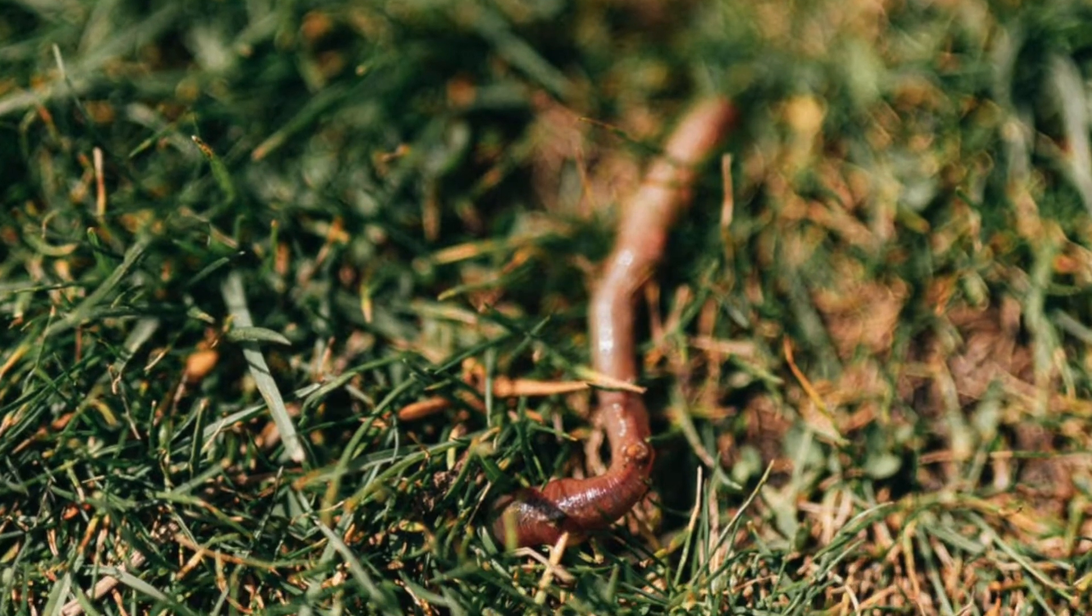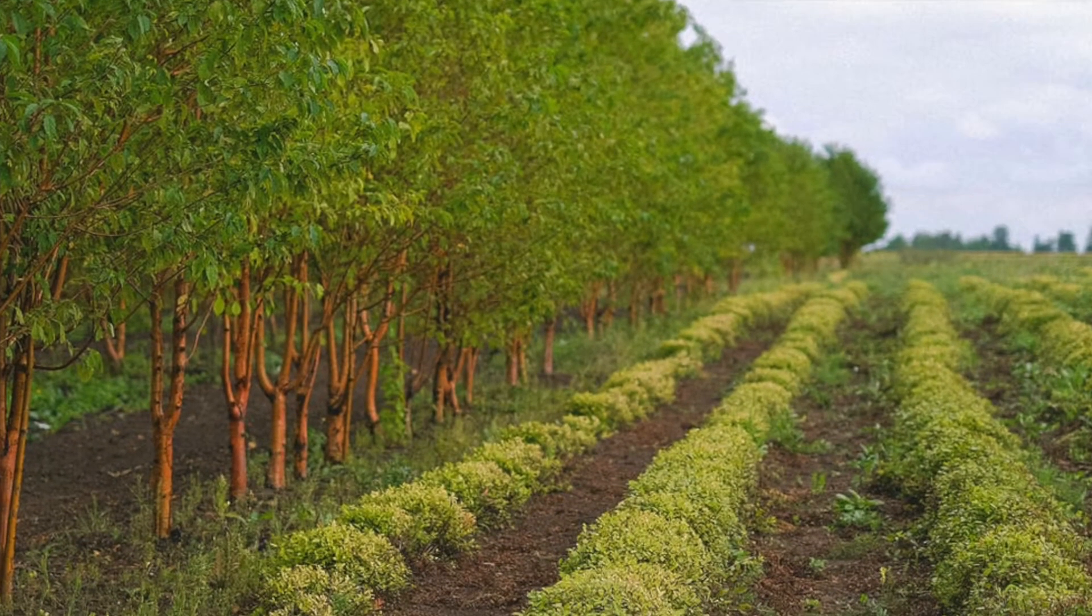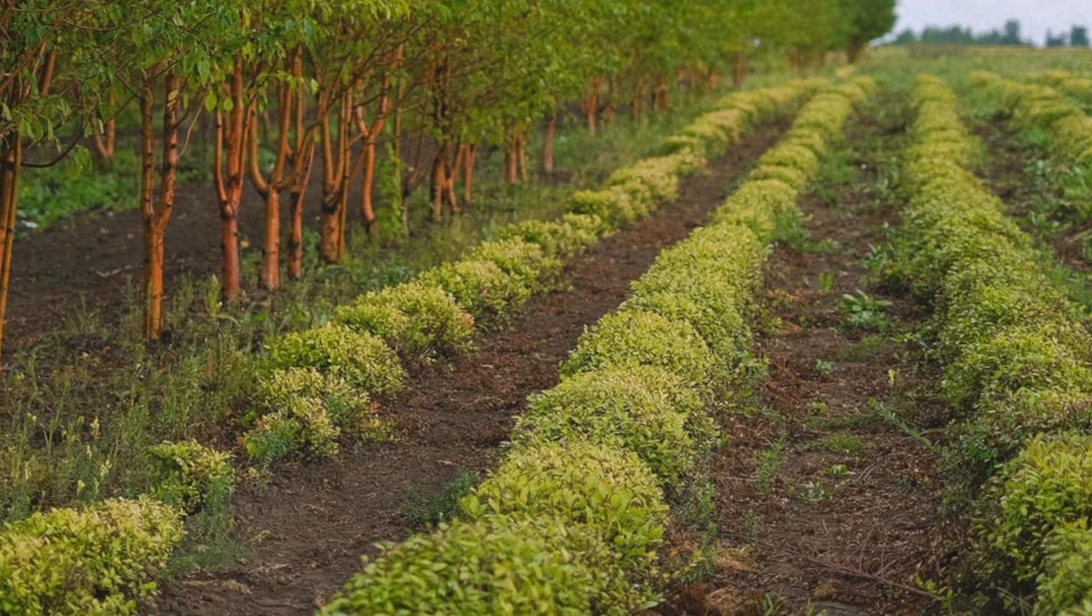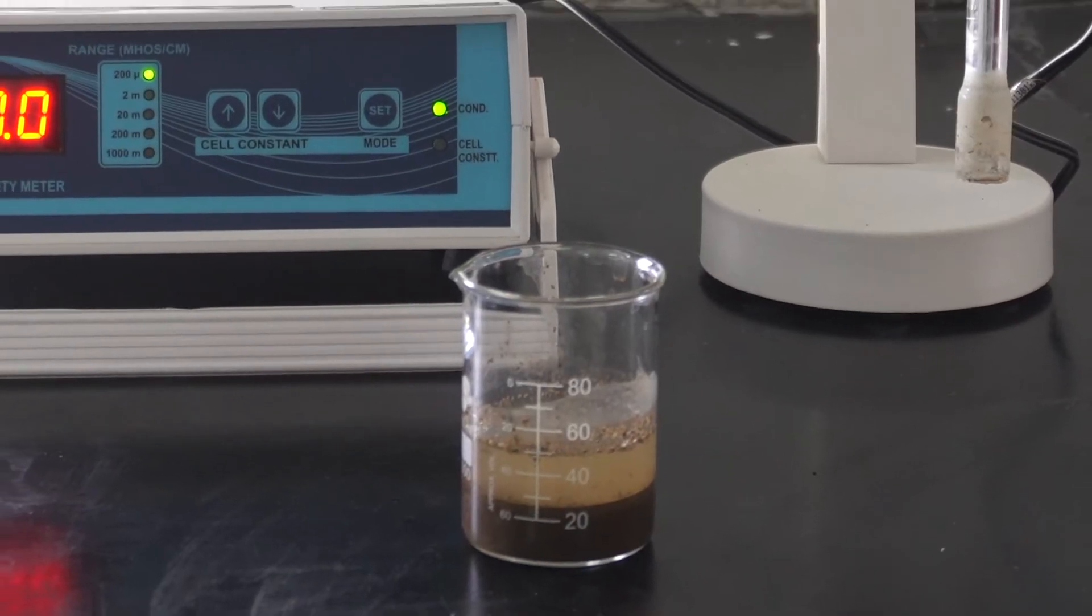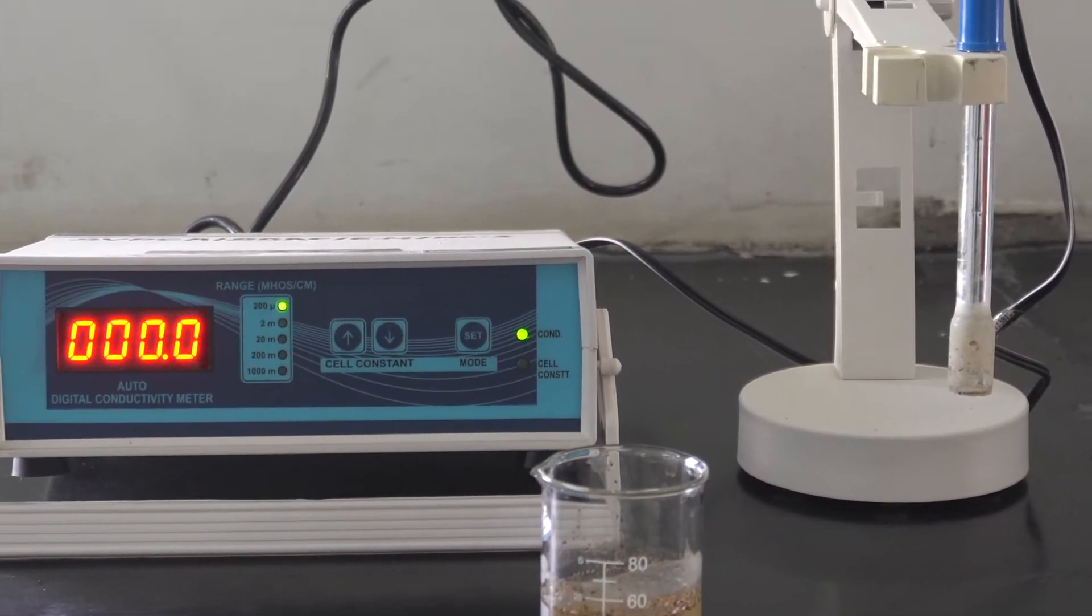In order to preserve the productivity of irrigated land, it is important to understand how to manage salts. Therefore, electrical conductivity is the key to making these measurements.